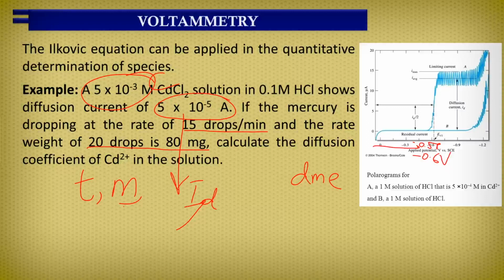Then gradually, it started increasing. So this sharp increase is where you now have your polarographic wave. And at this current, you notice that it is now constant. This constant current, we can extrapolate it to about minus 0.7 volts.